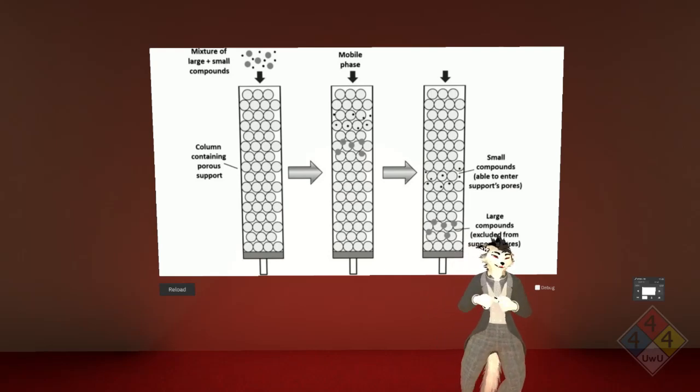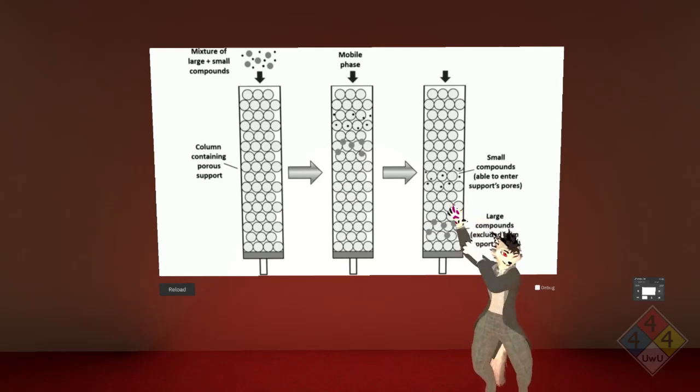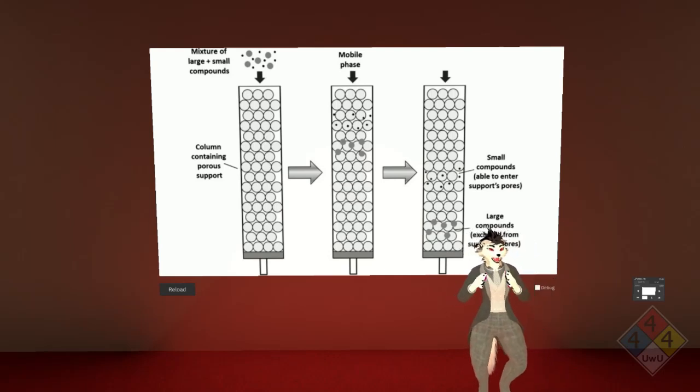And this is in liquid phase. At high pressure, it's pushing a complex mixture, usually an extract, through this, and the different elements in that mixture are going to interact with the material inside of the column. The column is the key word I want to have taken away from here. The column will interact with the individual components of the complex mixture and help separate them out.